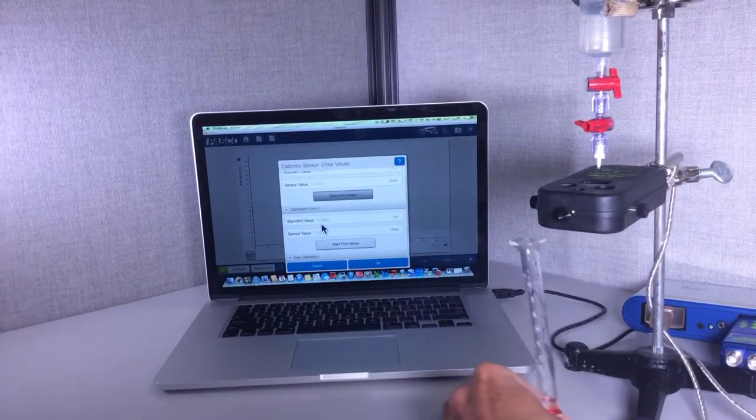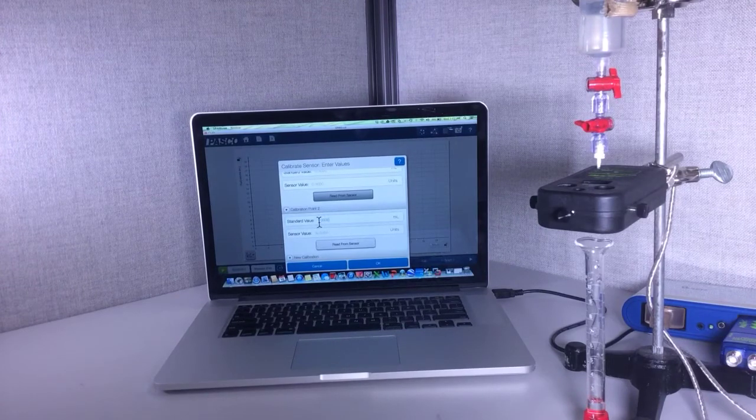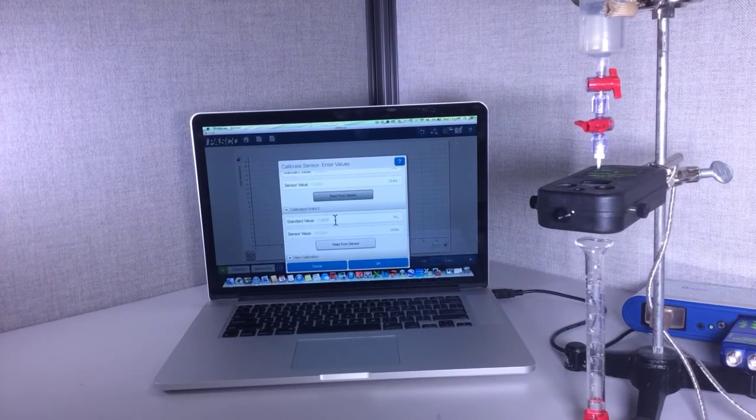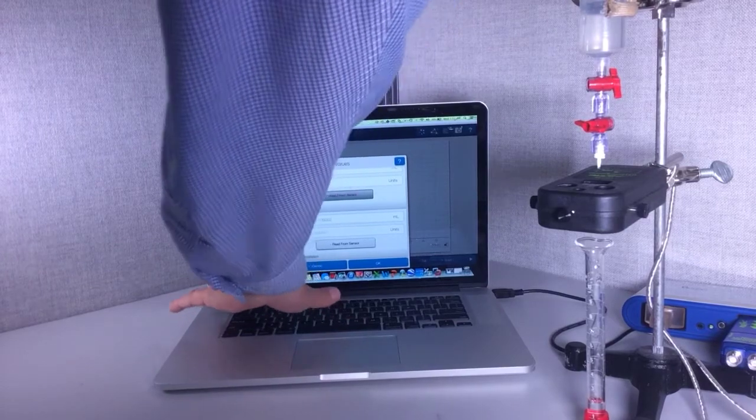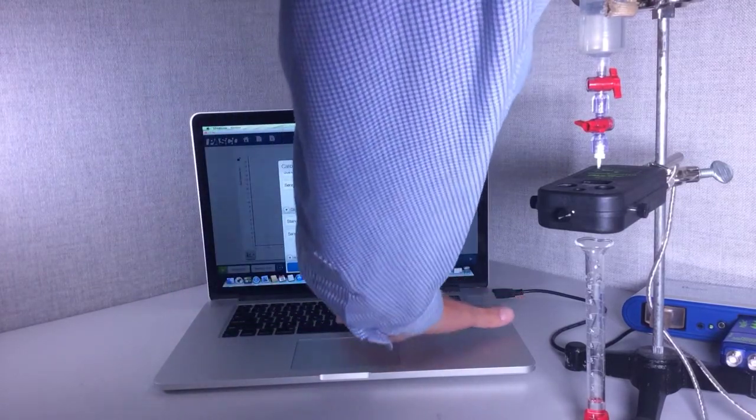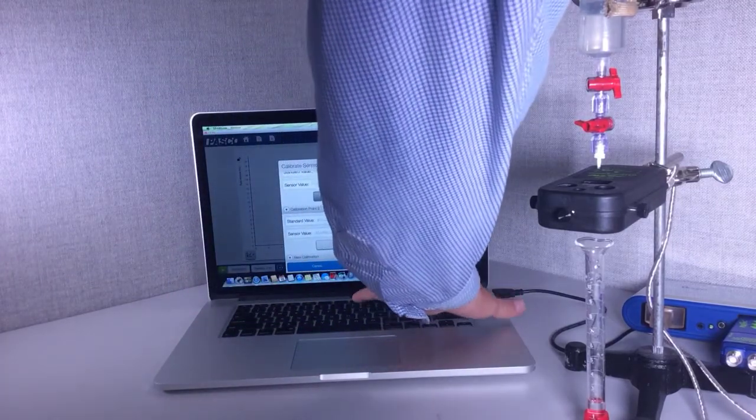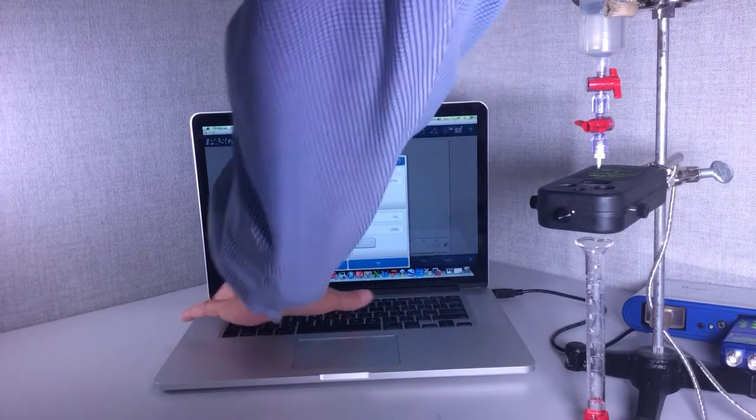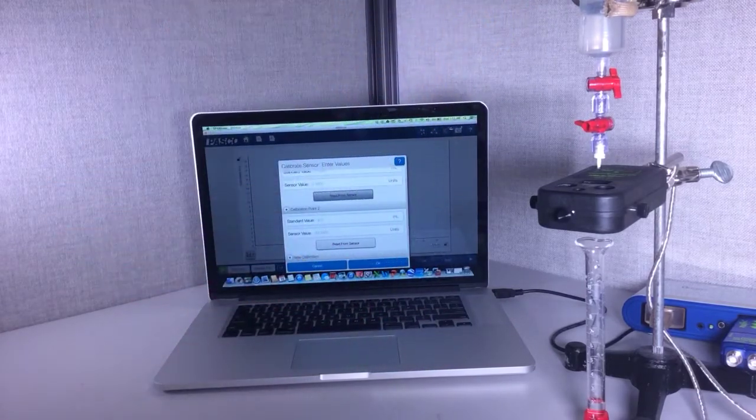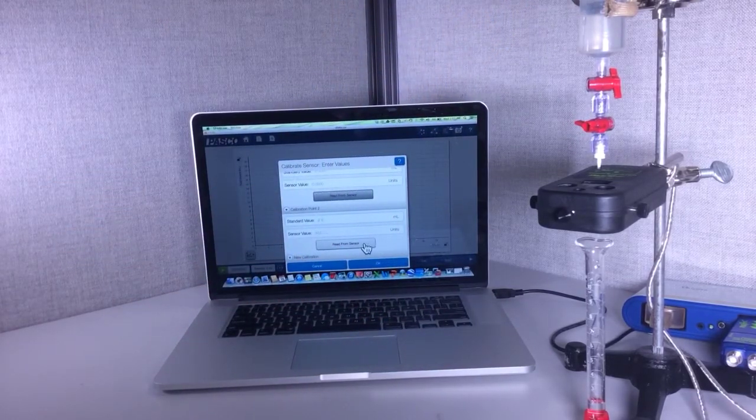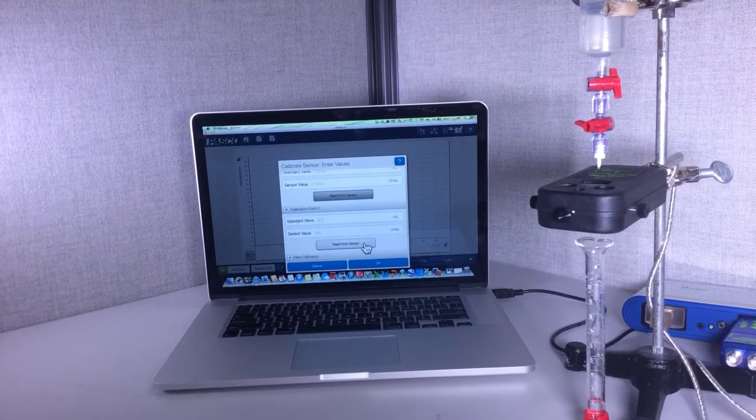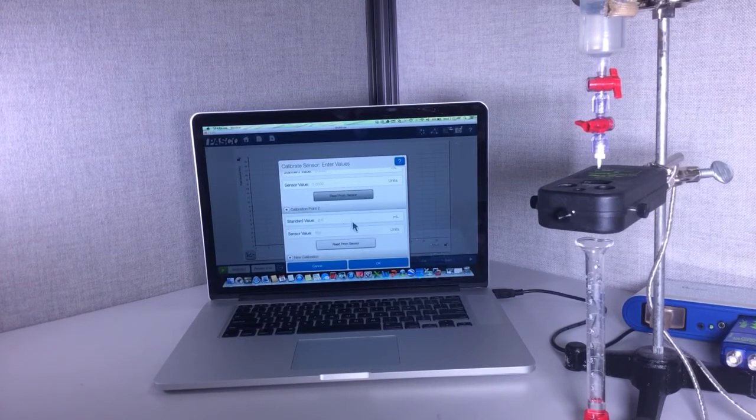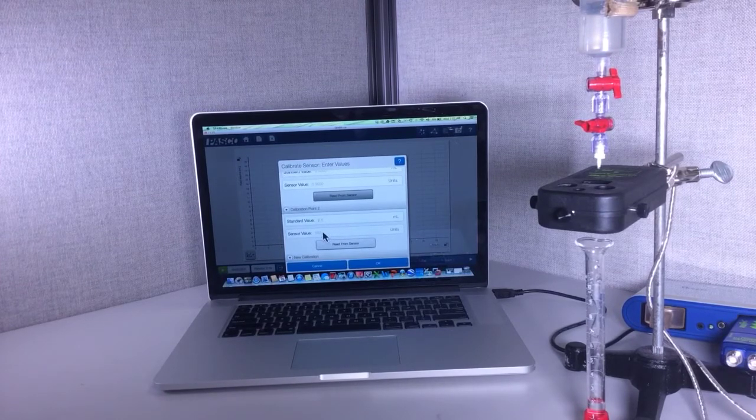So I'm going to type in right here 2.1, then I'm going to hit read from sensor. So now it knows that 2.1 mils is equal to 102 drops.